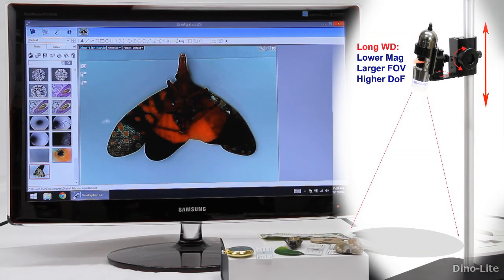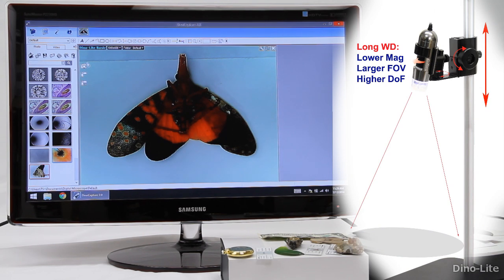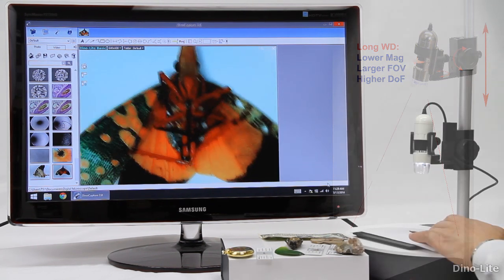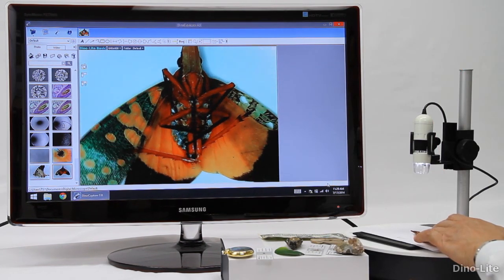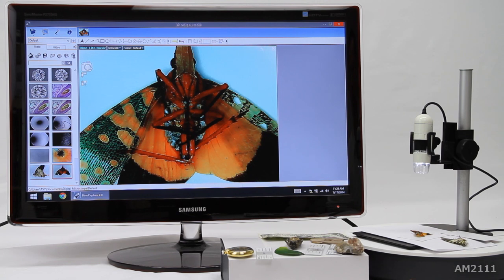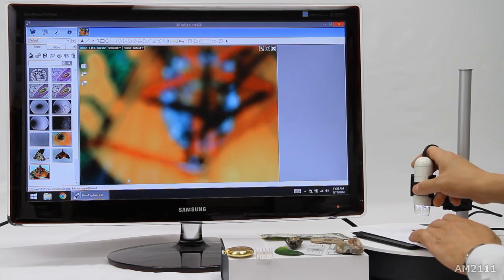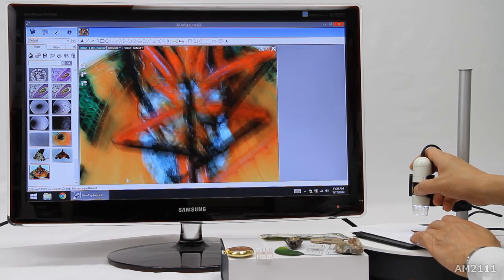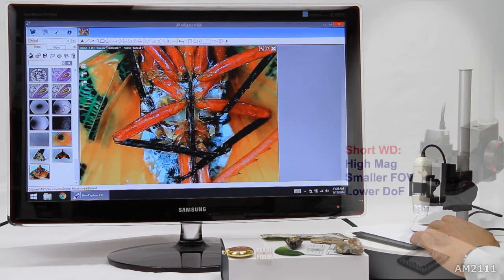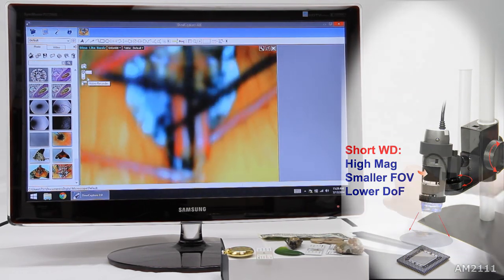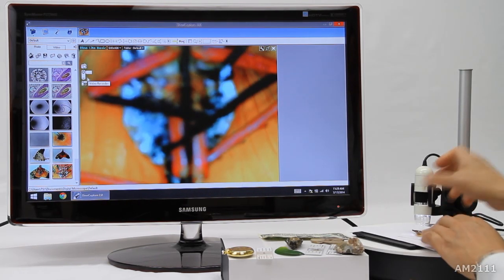When the DynoLite is further away it has a low magnification, larger field of view and higher depth of field. When closer the DynoLite has a higher magnification, smaller field of view and less depth.